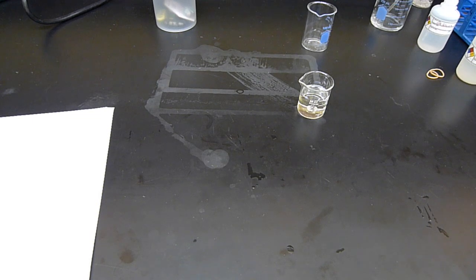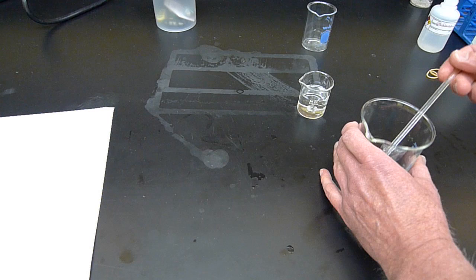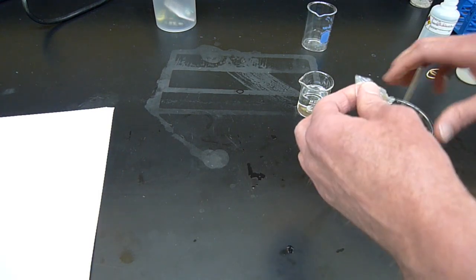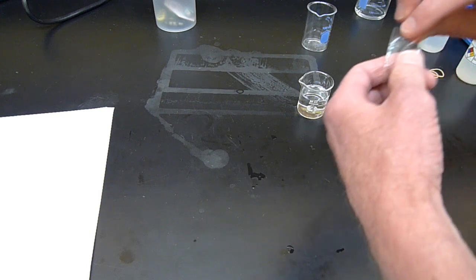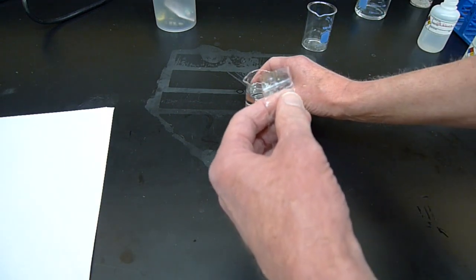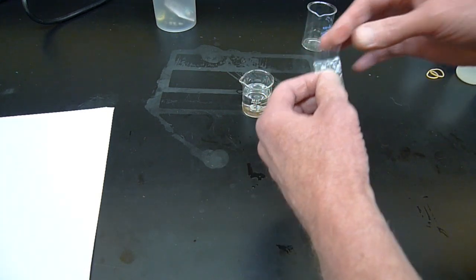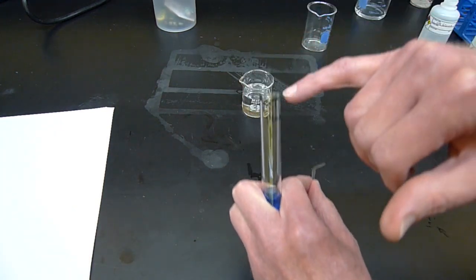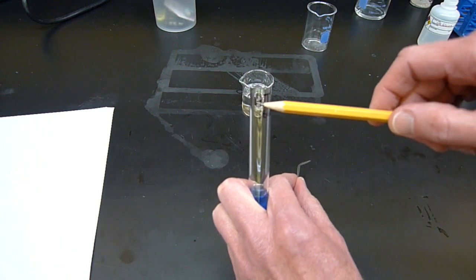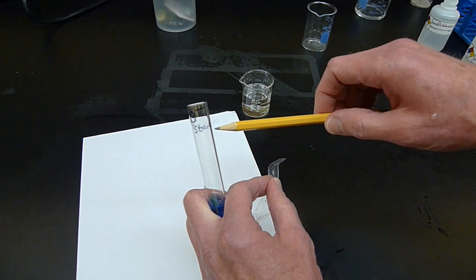And again, I'm going to take this piece of dialysis bag, this tubing tied into a bag here, and put in some glucose and starch. And then we're going to let this sit in the water here. So I have 2 tubes ready for Benedict's test. BT at the top here stands for Benedict's test at the start of this particular experiment.